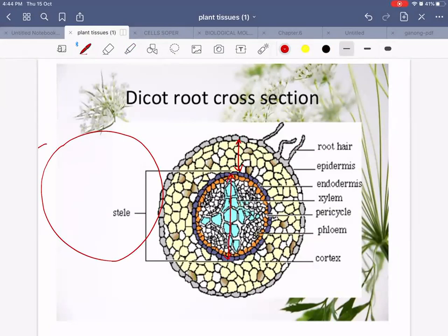So whenever I'm drawing the distribution of tissue in a plan diagram, the proportion of my diagram should be similar to the slide that I have been given. For example, if I am making the diagram like this, roughly this means that my diagram is very similar to the slide.